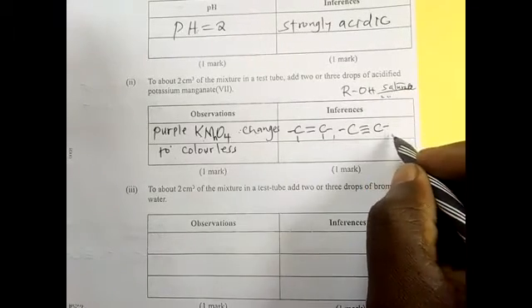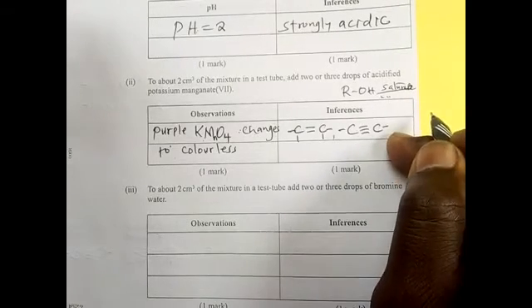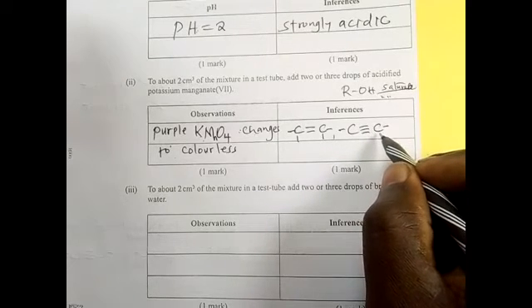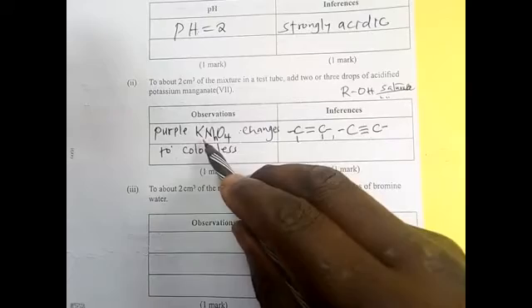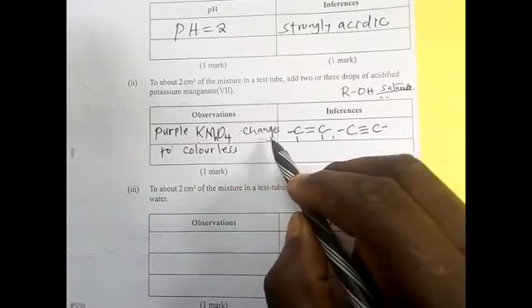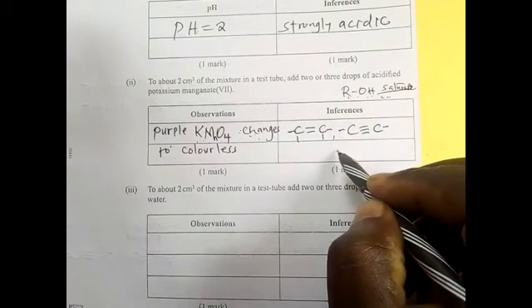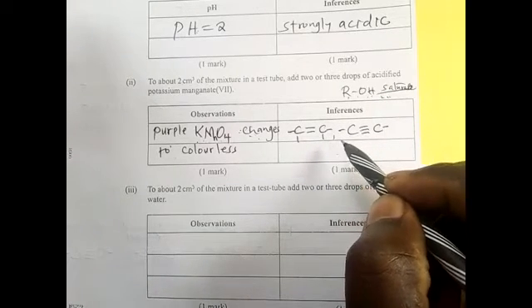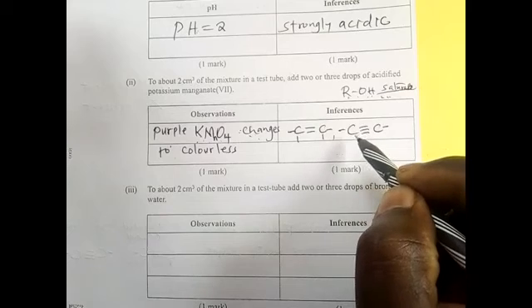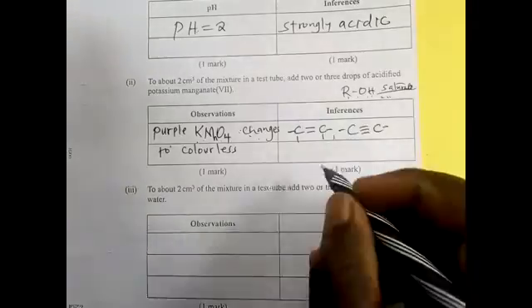So if we put ROH here, we contradict ourselves, because already we said that what is present is an unsaturated organic compound, alkenes and alkynes. Although acidified potassium permanganate is decolorized by ROH alcohols, in this case you are not going to put it here. So we say this one present.